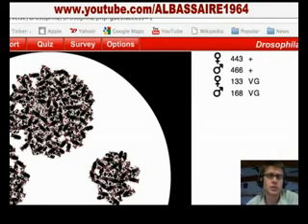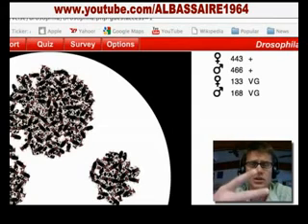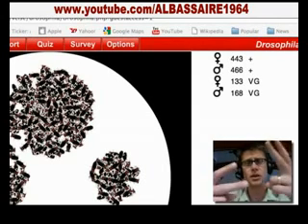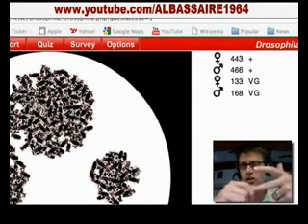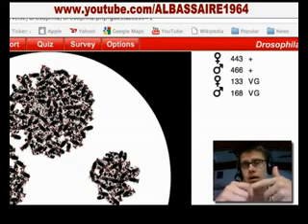But what do you do at this point? You want to figure out what's the inheritance pattern. So it's looking at this point like wild type is dominant, or a better way to say that is that vestigial is recessive. So we're going to look at, is it a recessive or is it a dominant trait? But then we also have on this matrix two other things. Is it an autosomal gene, or is it going to be sex-linked?